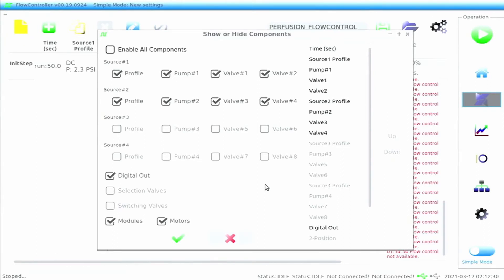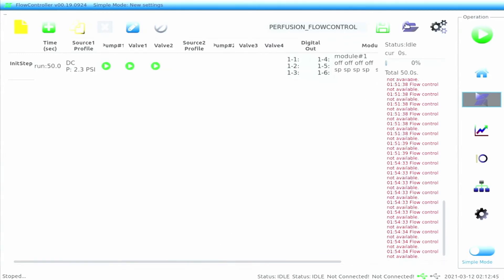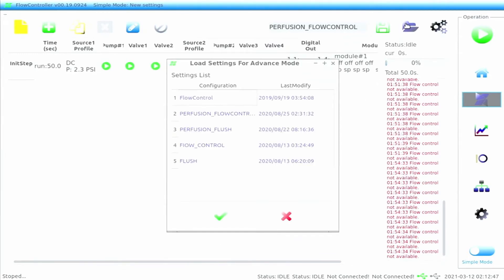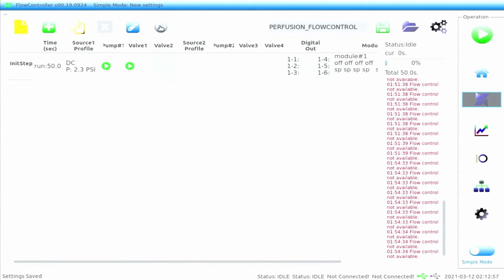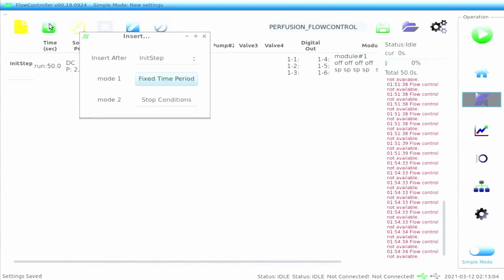If the rotary valve box has been selected, the rotary valve operation menu will be available in a new column and will allow users to click on the various ports to choose the position of each valve. The blue folder icon allows users to load older scripts. The green save icon lets users save their current script. The grey circular icon will clear the contents of an individual cell, and the green plus icon lets users add additional rows to the script.